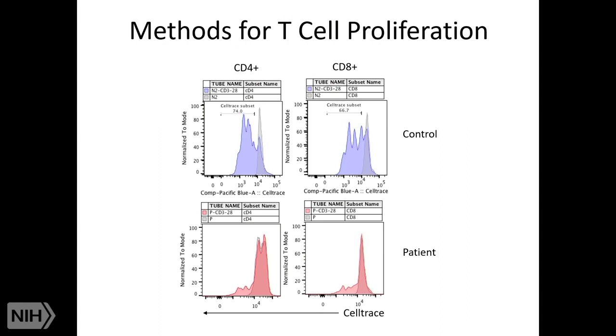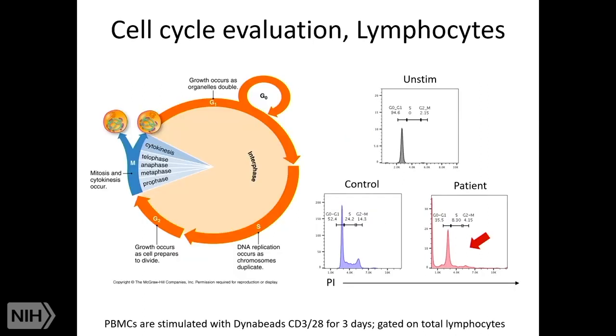divide. Before, when you used tritiated thymidine, you had PBMCs. Here, you can track each cell, how they divide. So it gives us another layer of information, not the bulk information about division. Here, you can track it by cells.